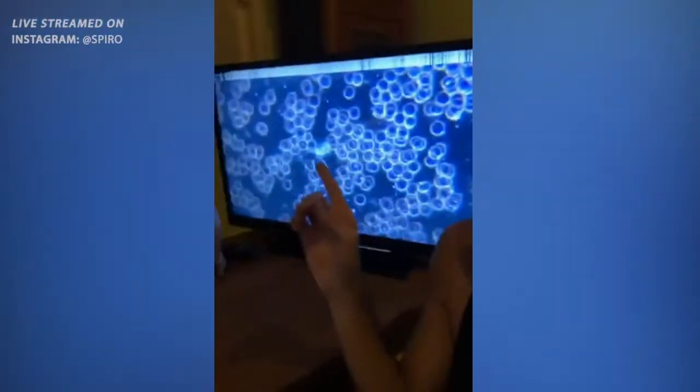But if you watch the Dr. Young interview, he will tell you exactly what he thinks it is. And he's got a lot of scientific proof of that. Are there blood samples to compare after other shots to see what the difference is with these? Well, this is normal blood and we're doing it live, and we're comparing it with vax blood. So it's vaxxed versus unvaxxed.